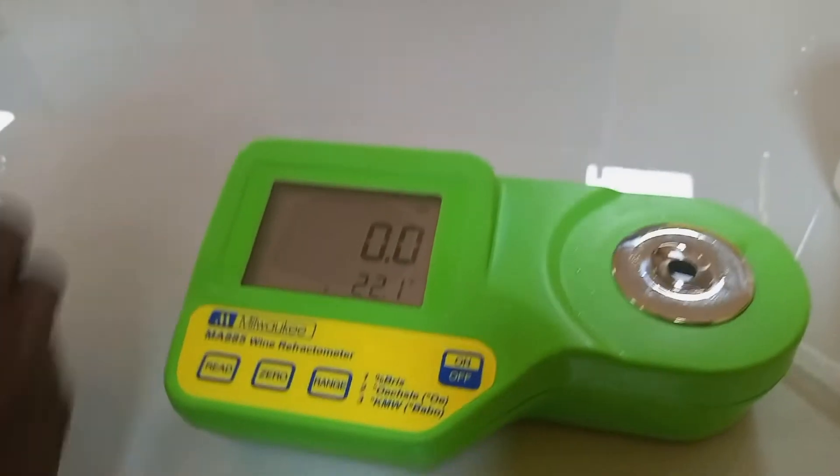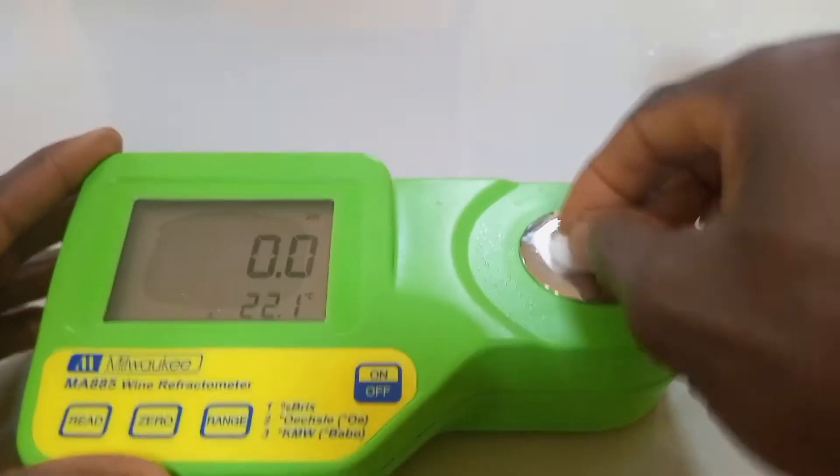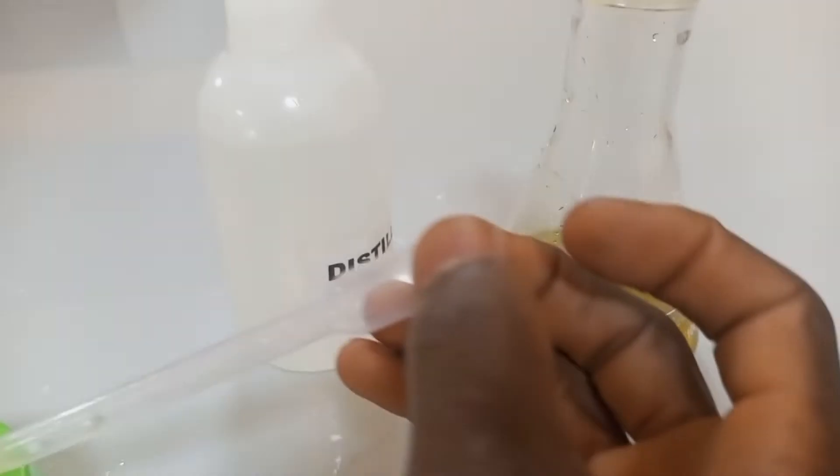Drain off the distilled water. Introduce the sample to be analyzed.